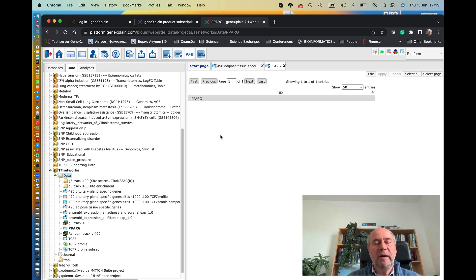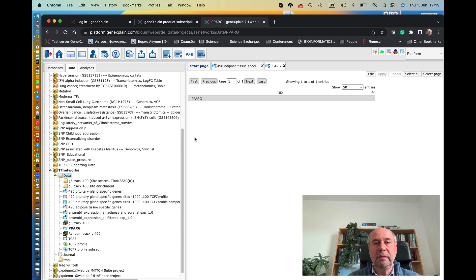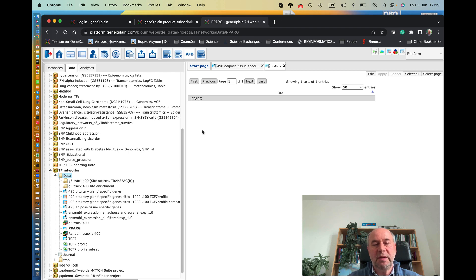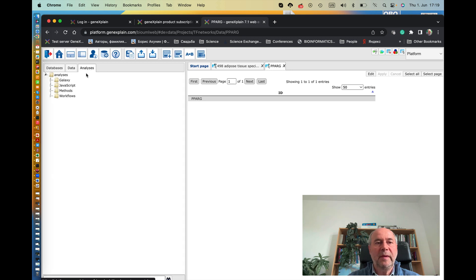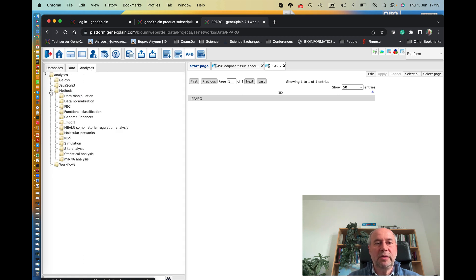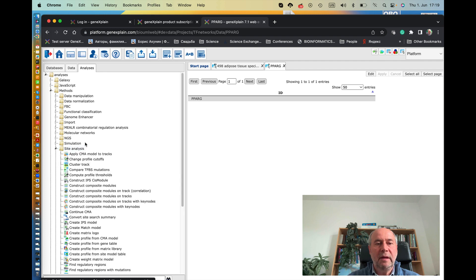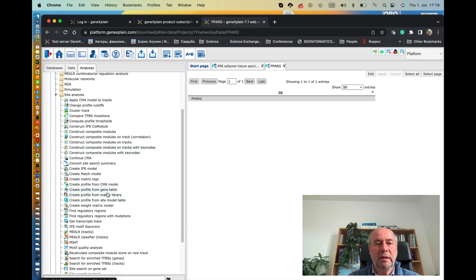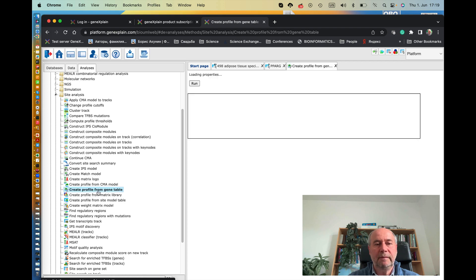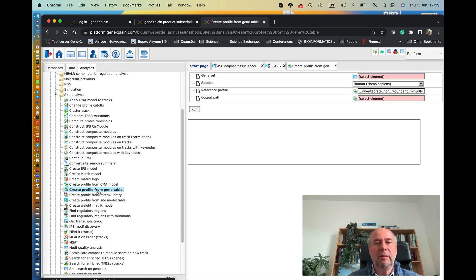And now we have to convert this gene into the profile of all motifs in TransFac which are associated with this transcription factor PPAR gamma. For that, we go to the analysis tab, and here in the method section, we go to the site analysis, and here we see a method called create profile from the gene table. We double click on it.